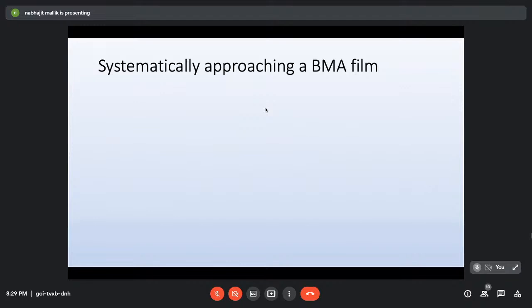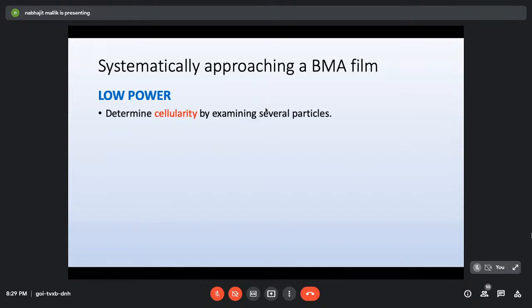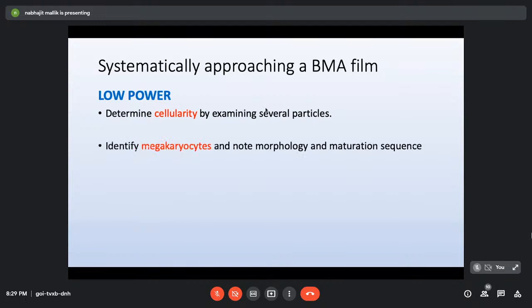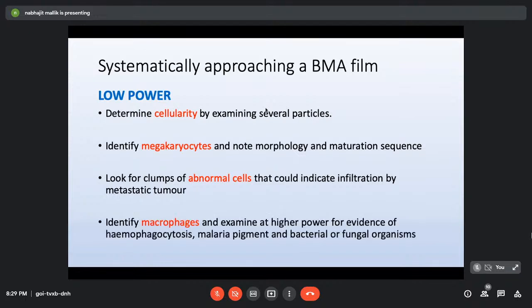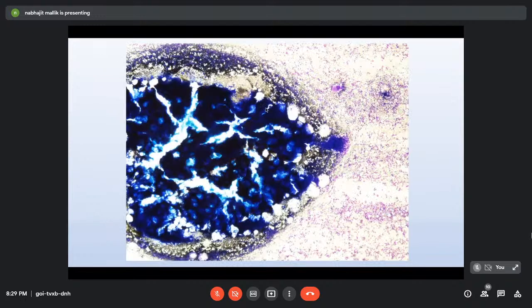For systematic evaluation, first go to low power. In a bone marrow aspirate, four things to look for at low power are: cellularity, megakaryocytes (identify and note morphology and maturation sequence), clumps of abnormal cells indicating metastatic tumor infiltration, and macrophages/histiocytes. At scanning power (4x) only bone marrow particles and megakaryocytes are identifiable — all other cells appear as tiny dots and cannot be individually examined.